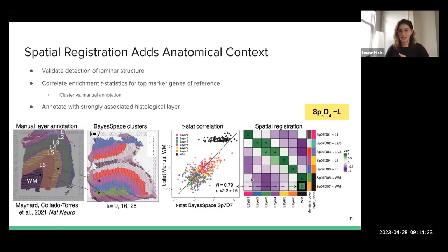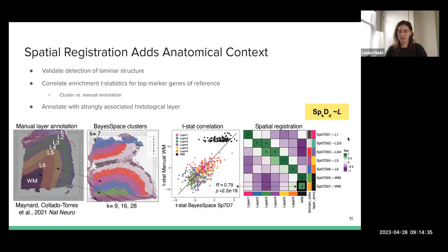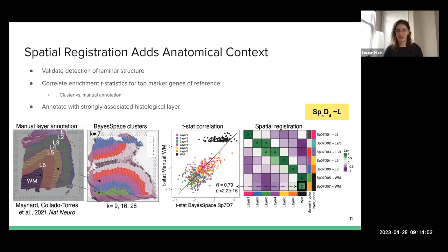You do that for all pairs across the two data sets, and you end up with a table that looks like this green and purple heat map. These really deep green spots mean they have really positive correlations. So spatial domain 07 really highly correlates with layer one — that's basically the conclusion we can draw here. We're able to map our new data back to our old data and see how they compare and contrast and where the data match up.